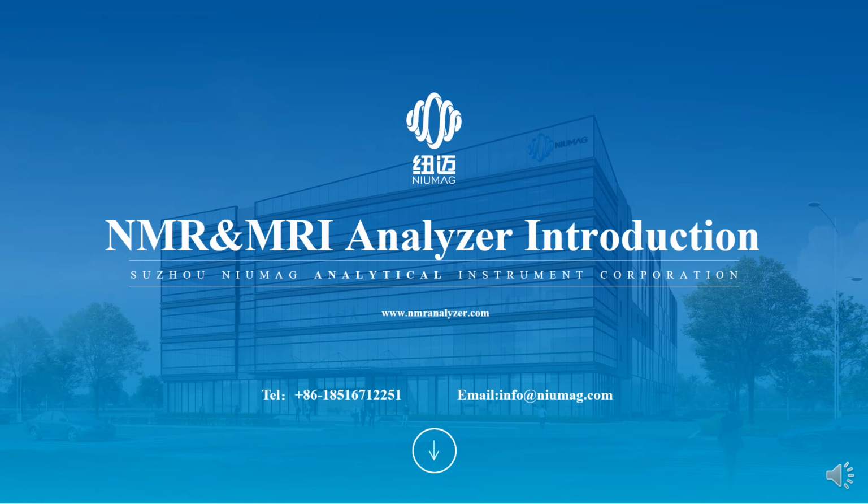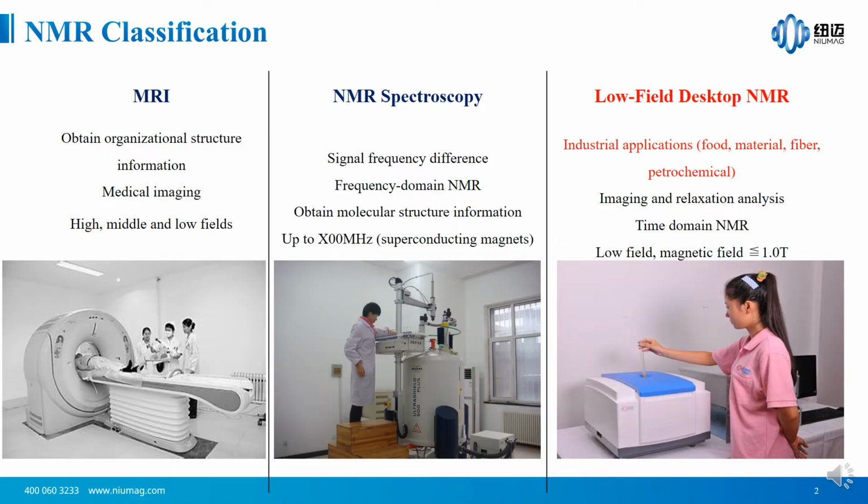In this course, I will make an introduction of education NMR and MRI instrument. First, let's look at the classification of NMR instruments. The first picture should be the one we are most familiar with.